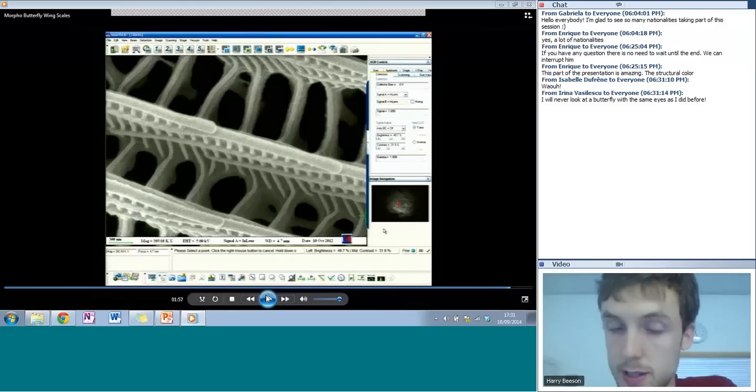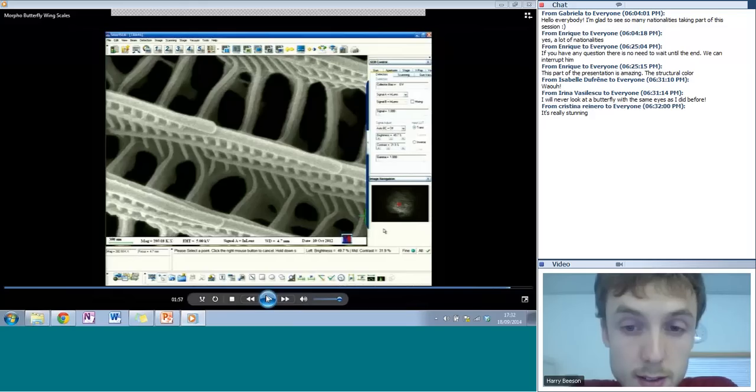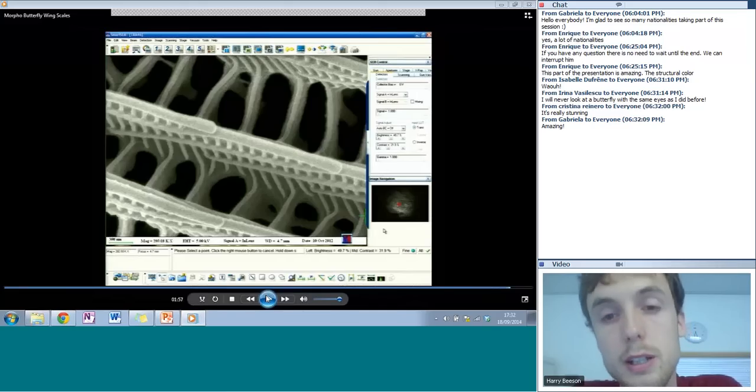But it's achieved by scanning that very small electron beam across the surface of your sample, sort of in a row. So is this the biggest zoom you can see, right? Because it is based on electrons. It depends on the microscope. Okay. So what's the resolution? If you've got all the conditions really perfect, it can go down to sort of a nanometer scale.